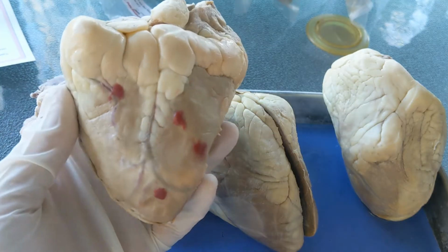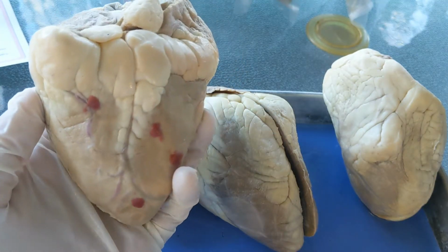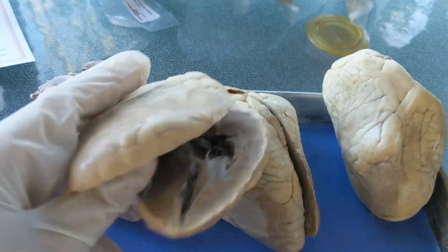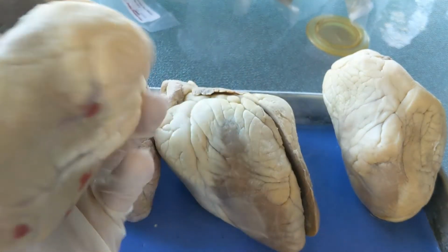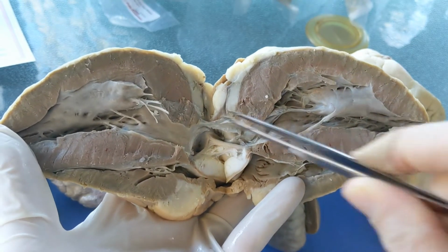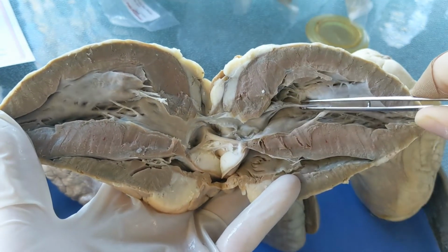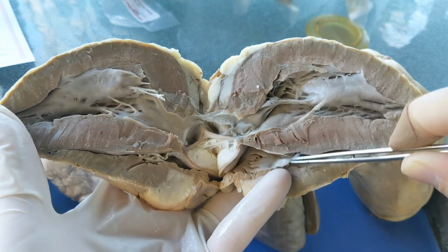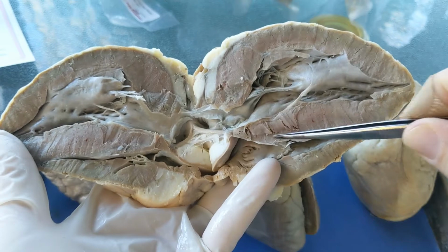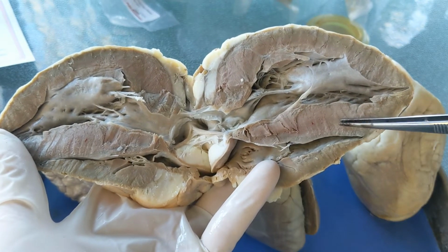Look for clotting of any kind, because clotting is linked to something. I'm not going to tell you what because you should know. But blood clots in the coronary arteries, you need to know what that indicates. You also want to check the valves. Make sure the valves look intact. These valves are gorgeous.